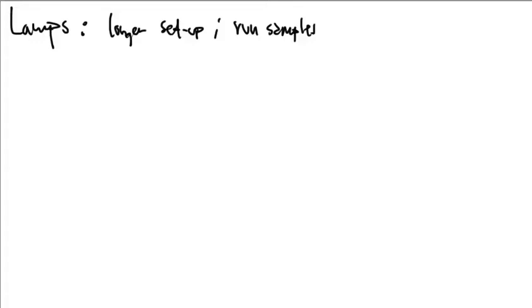All right, now let's talk about this issue of the burner head. So the first thing that you have to understand is that the burner head is really only equipped to take liquid samples. That's typically what we're analyzing on an atomic absorption spectrometer. This is not like an infrared that can take a solid, liquid or gas.